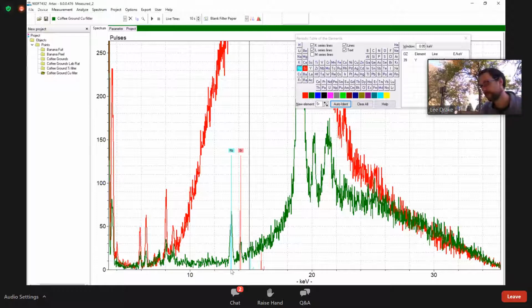So let me give you a hypothetical here. Let's say you're an academic, you have a budget for 100 ICP-MS standards that are hyper-tailored for exactly the matrix you're looking at. Maybe it's a specific rock type, maybe it's lead-glazed ceramics, but either way, you are 100% confident that all you need to do is measure this one exact matrix type. Then a Compton normalization can work pretty well, because the Compton is going to reflect those changes that will get passed on to your element identifications.